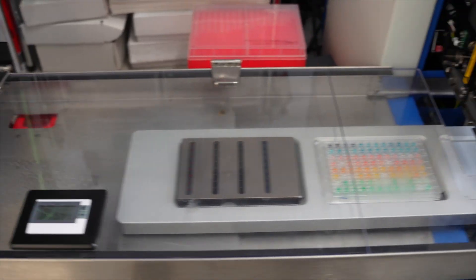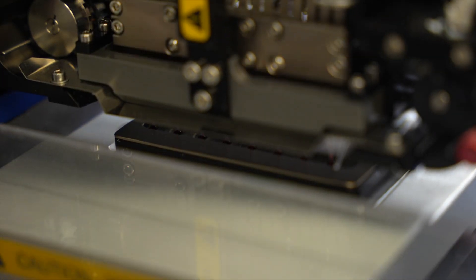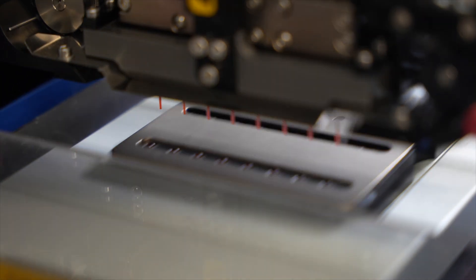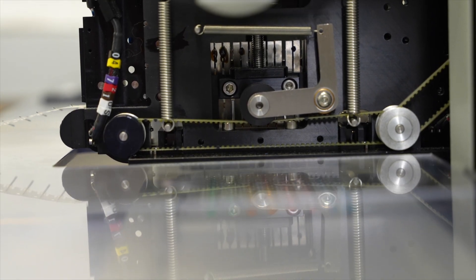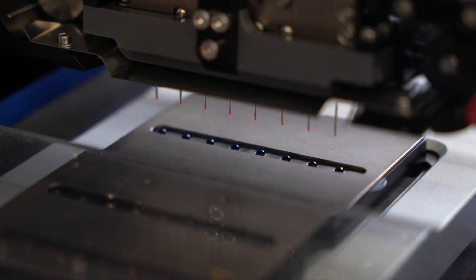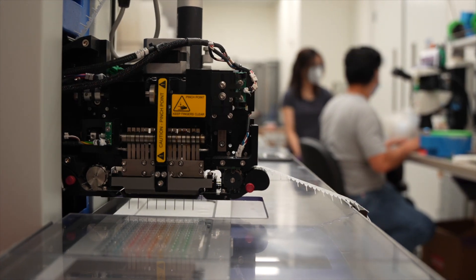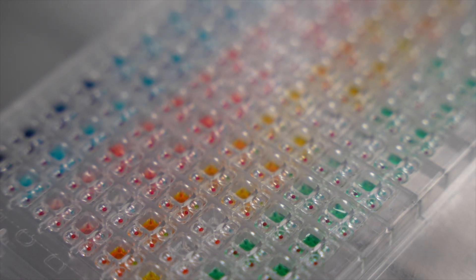This robot is a liquid handler. It helps us set up crystallization experiments so that we can try up to 288 different conditions in a single tray. This robot is fast, but that's not just a convenience. It's actually very important to set up each tray as quickly as possible. If you move slowly, the tiny drops of liquids we're using might evaporate before we seal the tray.